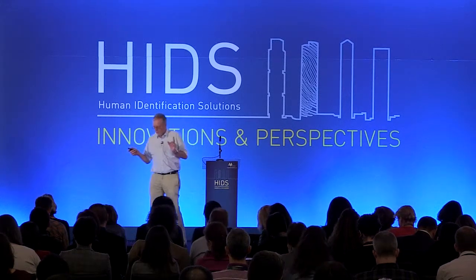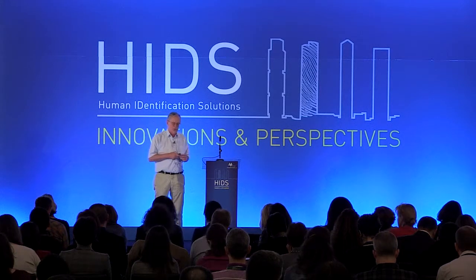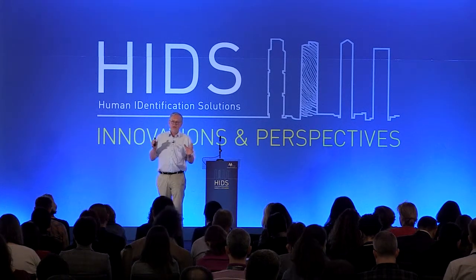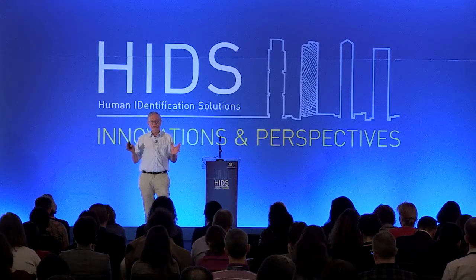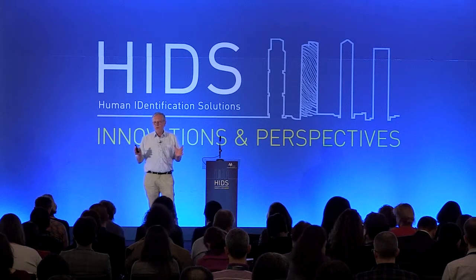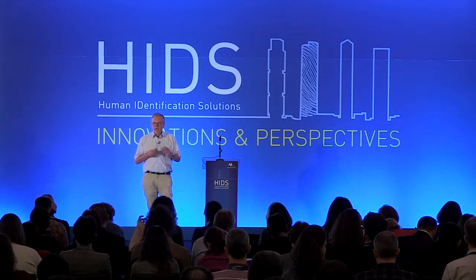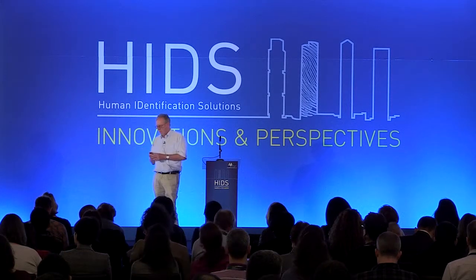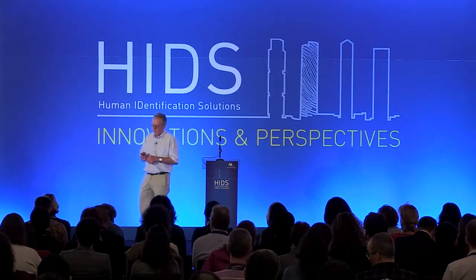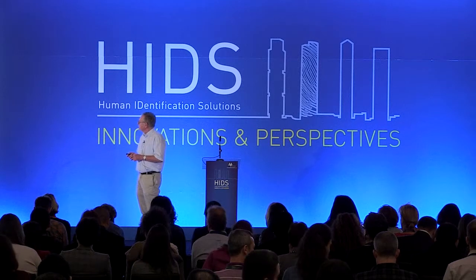I know that other laboratories may have seen even more, but we have a process going on in our lab where we want to make databases for all the systems that we want to work with in the future. In the beginning, we will start with approximately 200 individuals, and then later we will catch up with the results that we get from our usual work in paternity testing, immigration testing, and in crime case work.